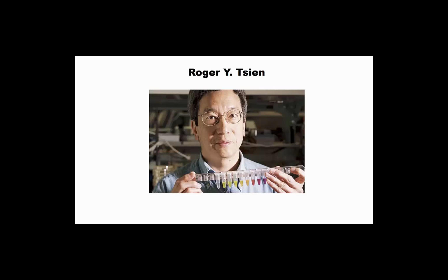And the scientist's name is Roger Tsien. I expected he would get the Nobel Prize for this. Well, he got the Nobel Prize, but not for this work. He got the Nobel Prize for different work. We are going to see his other important work for the Nobel Prize in a later part. But now let's enjoy those calcium signaling powers using these Fluo dyes.